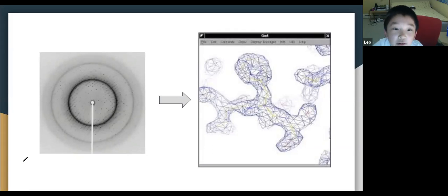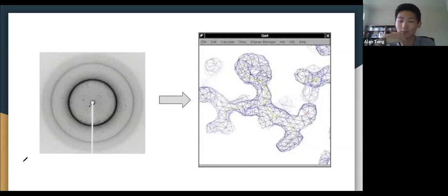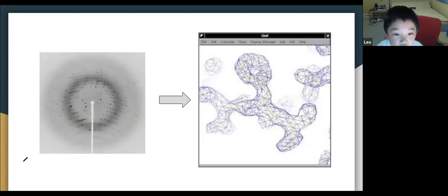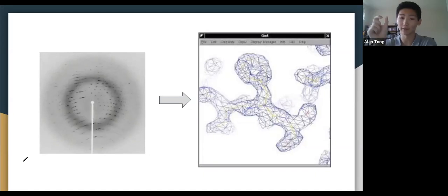I think that probably if it's any other wavelength, once you shine it into the crystal, you'll get a different result and it won't be the same. Yeah, that is true, right? You'll get different results with different wavelengths. Mia says you need high frequency, and that is the key, right? The idea is a frequency, which you can also translate to wavelength.